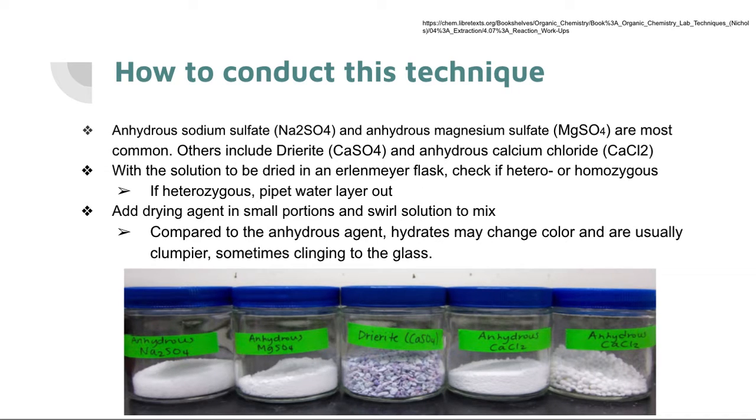There are several different kinds of anhydrous agents. Magnesium sulfate is kind of the go-to drying agent because it works quickly, holds a lot of water compared to its mass, and the hydrates are notably chunkier. There are some downsides to it, but we'll get to those later.